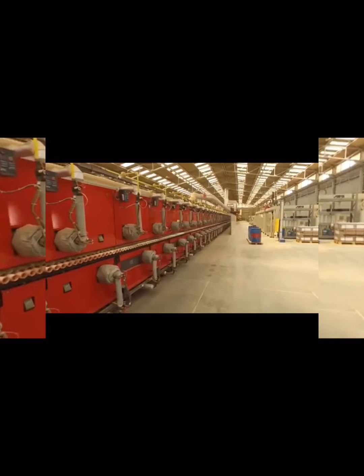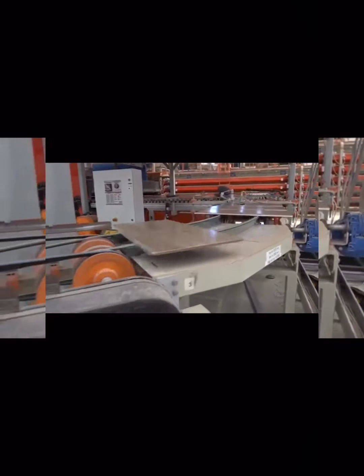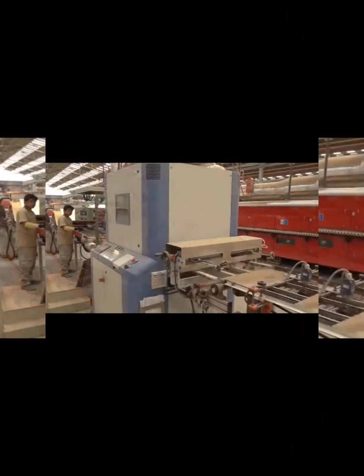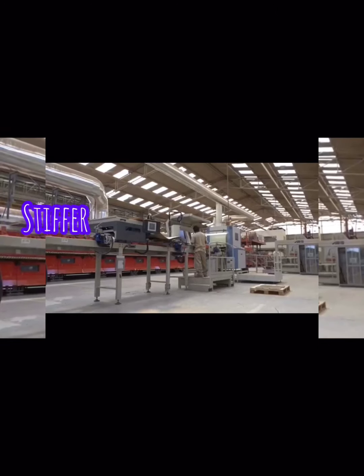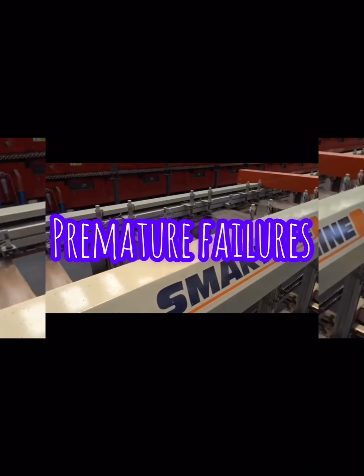So the question now is, what bending type to use? According to some ceramists, it is said that the 3-point test is recommended for homogeneous materials like plastic, while the 4-point bending test is more suitable for non-homogeneous materials like composites, which are stiffer and more brittle.